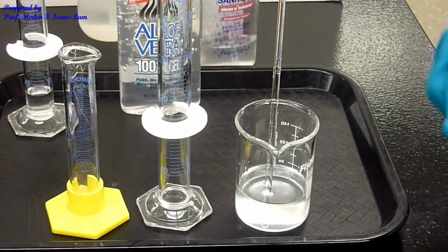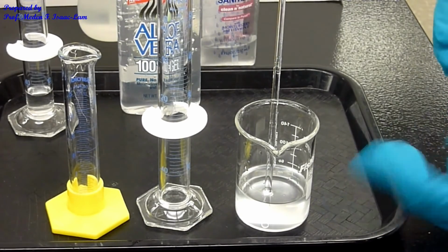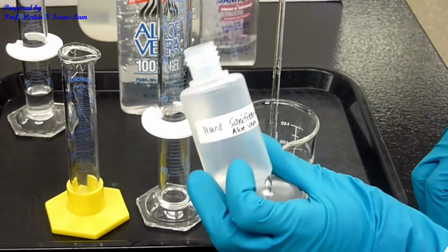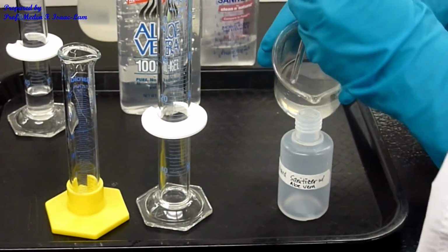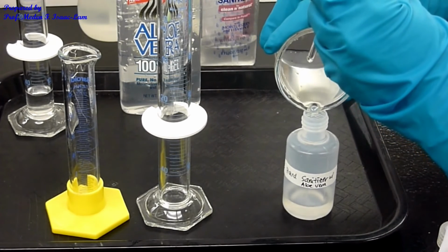Now you can say, for example, I want to keep it, right? So I can label this little container hand sanitizer with aloe vera, and I'm going to pour it here.